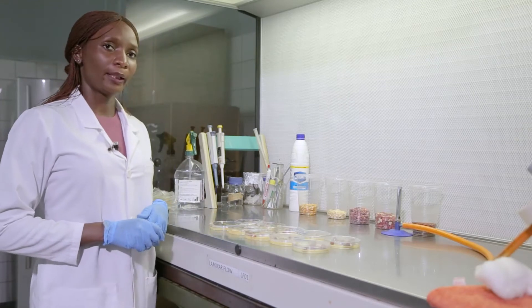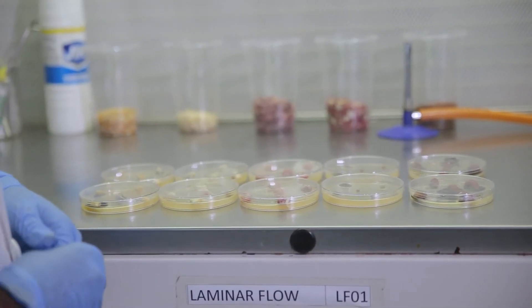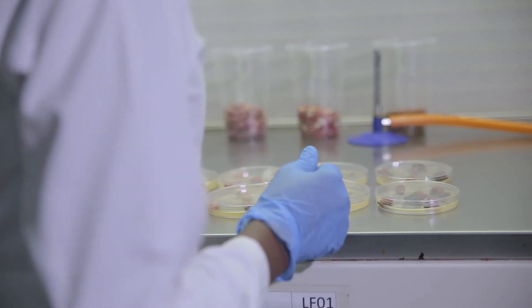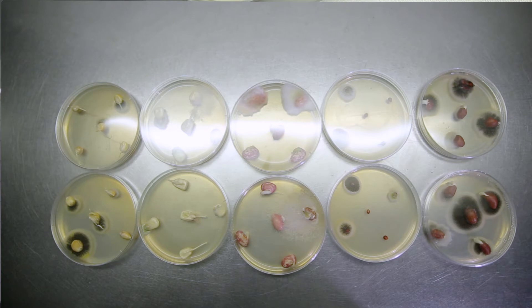After three days at 30 degrees in the incubator, we can now take a look at our results. What we see here: we do have molds on the seeds. The molds that we consider are those that are growing on the grain or that are surrounding the grain.